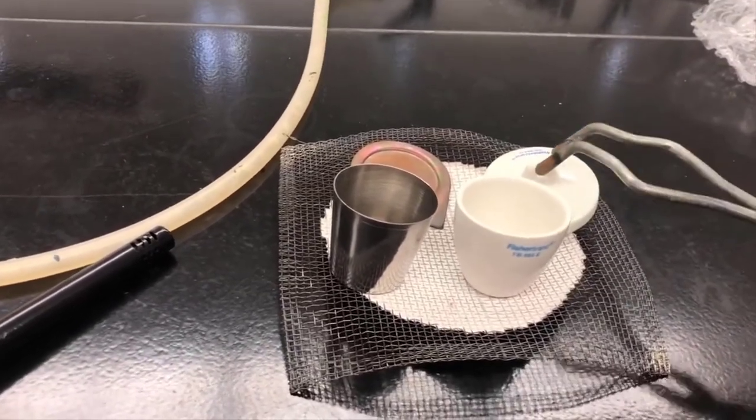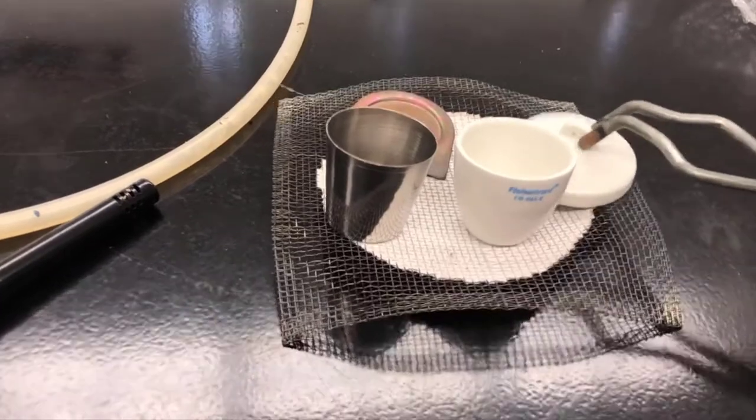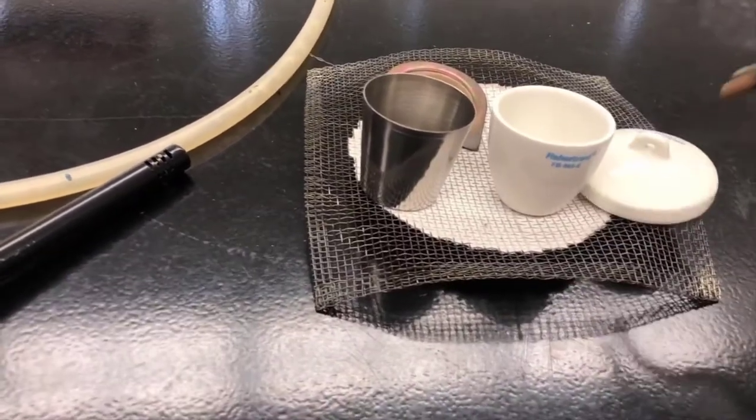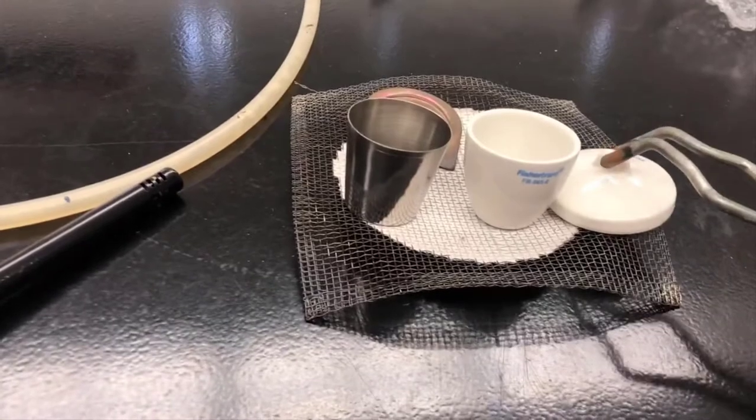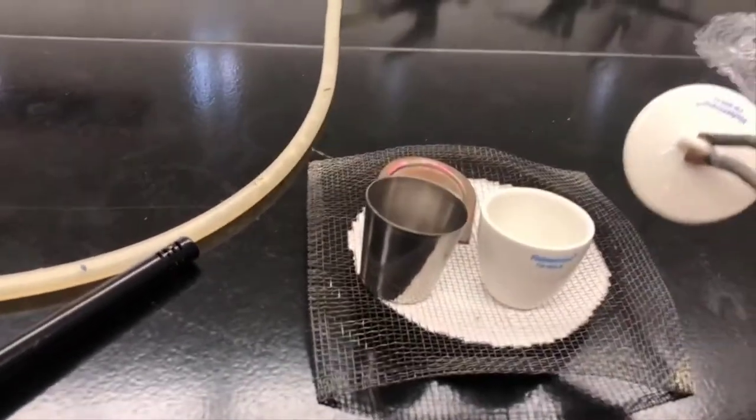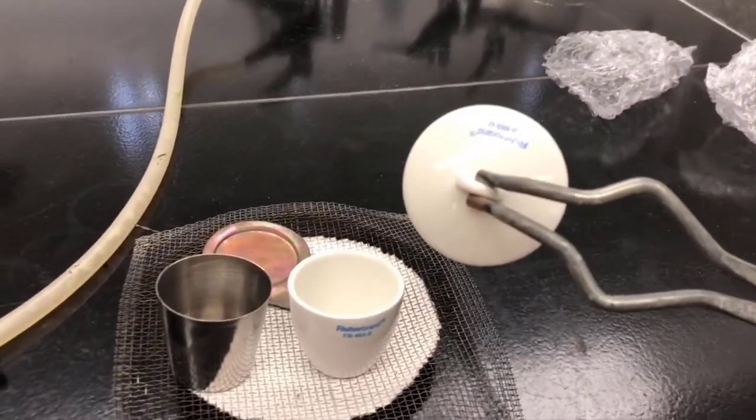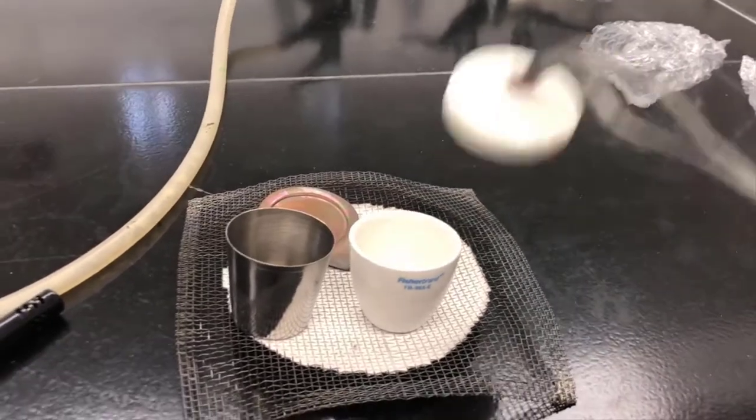So I'll show you how to handle these crucibles. You'll notice there's a little hole on the top. A lot of times people will put a little wire on there to grab, but I've always learned that if you grab it with the crucible tongs like that, it's pretty hard to drop.